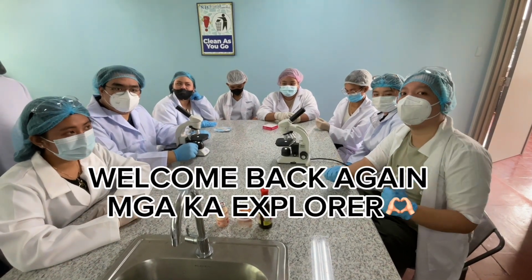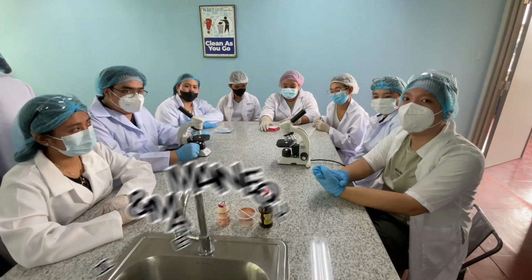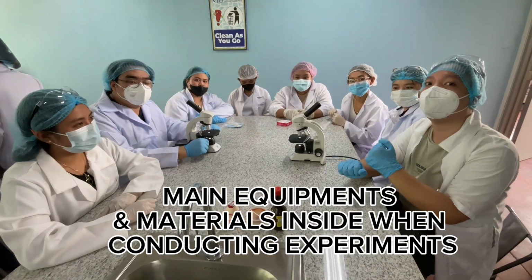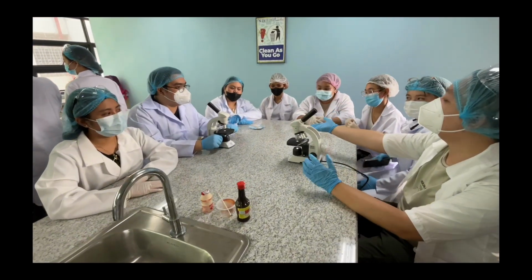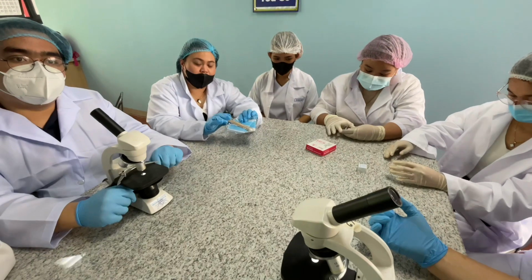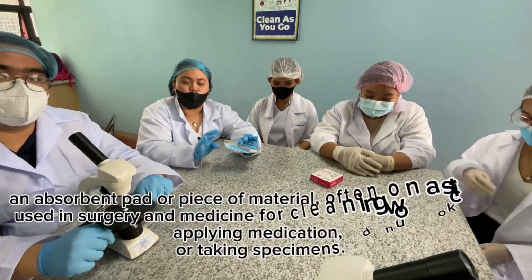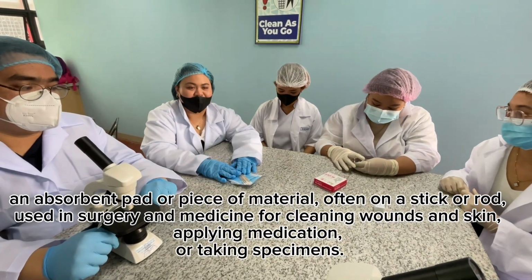And this afternoon, we will find out what the main equipment and materials are that we use inside when conducting an experiment. Right? So first, we have here our small materials. Can you name that please? This one right here is the swab. It is used for us to transfer from one specimen to the slide. Thank you so much.